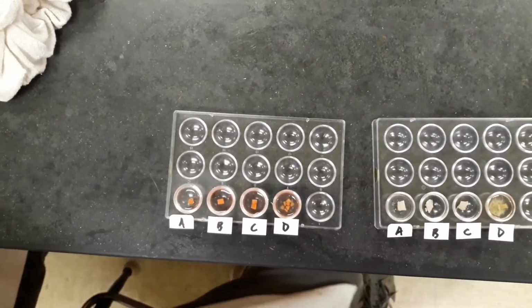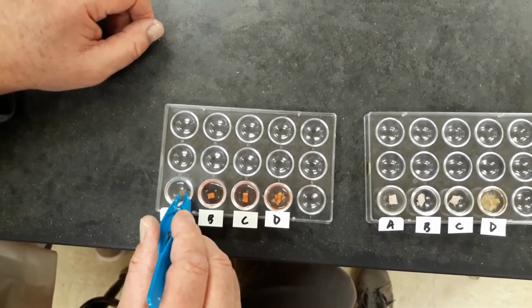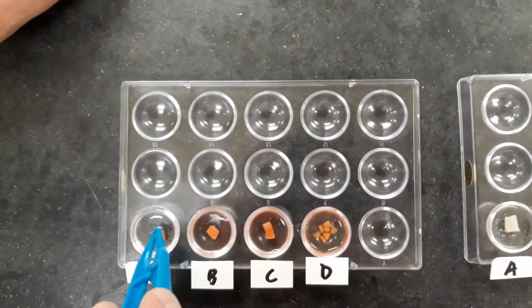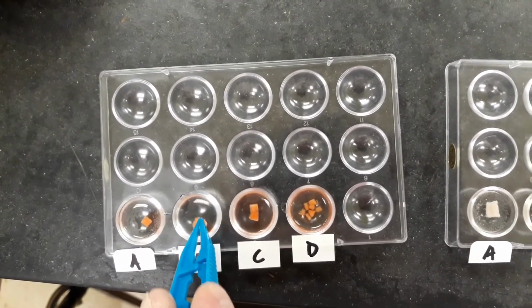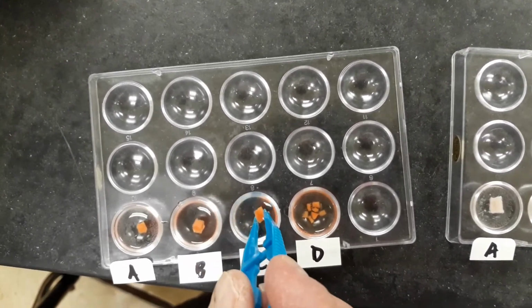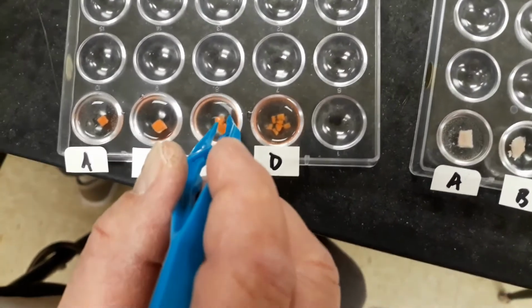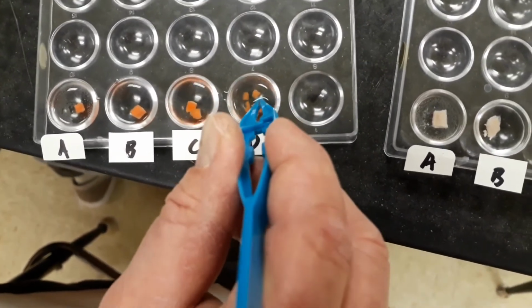Okay, so here we are, section E, the effect on organic substances. Here's a piece of carrot that's been sitting in A, and it's still intact. B, still largely intact. C, mostly intact, although I was able to break it in half. And then D is pretty much mush.